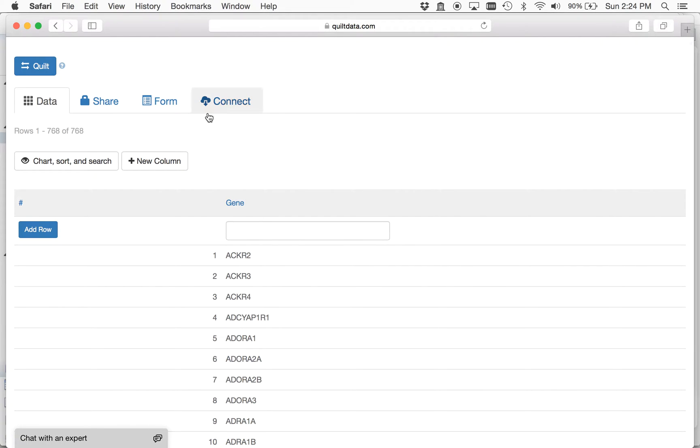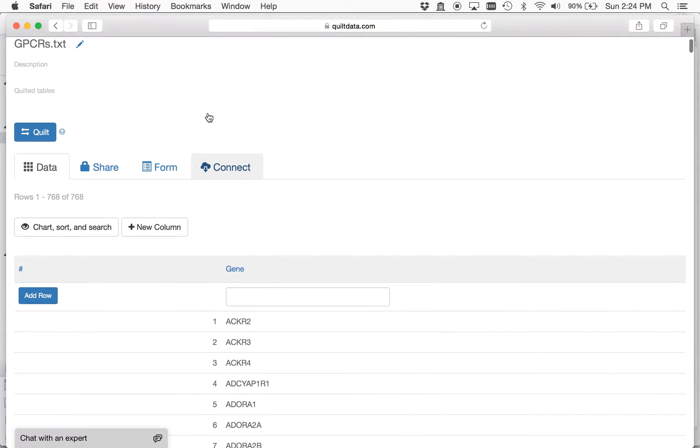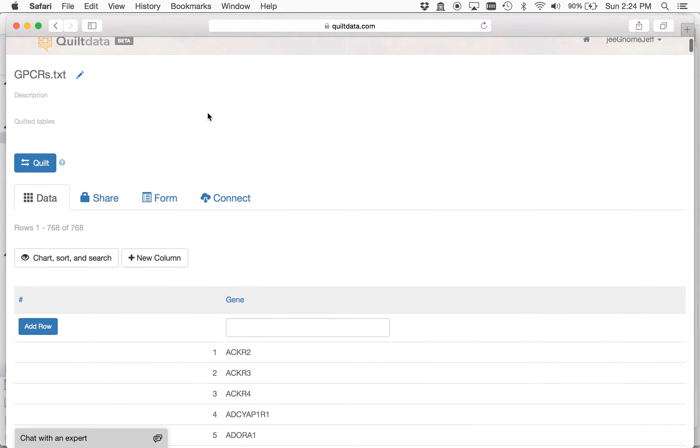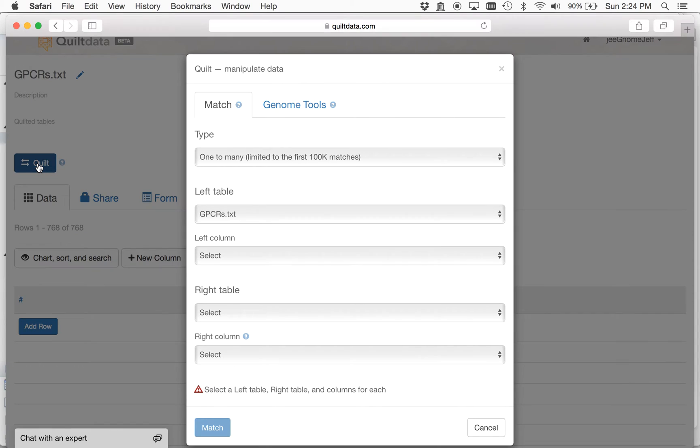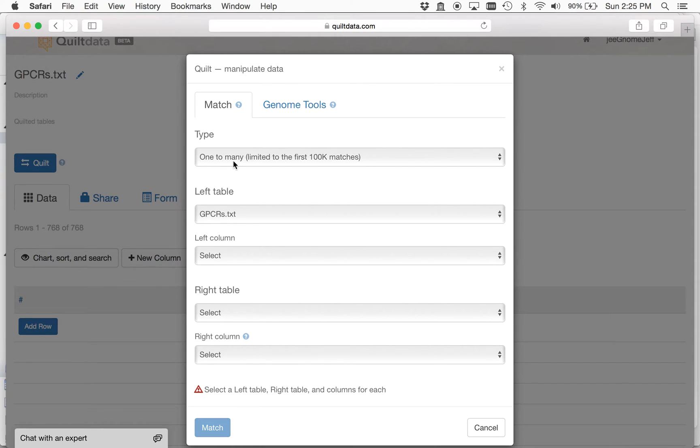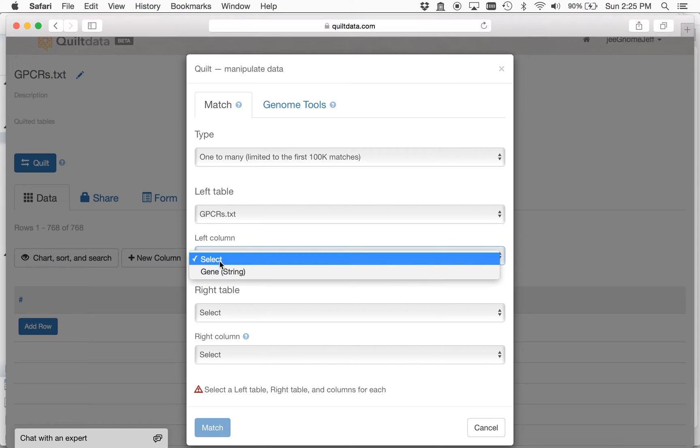And what I want to do is join this up to a publicly available genome-wide screen and just select out or match on the genes that I want to study. So I'm going to do a one-to-many here, because for each one gene there's many guide RNAs and the DNAs to design from there, and I'll select Gene here.